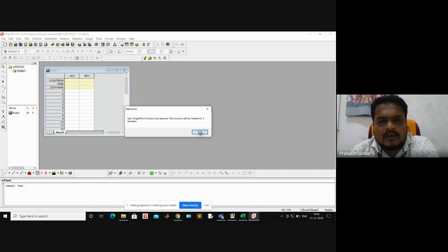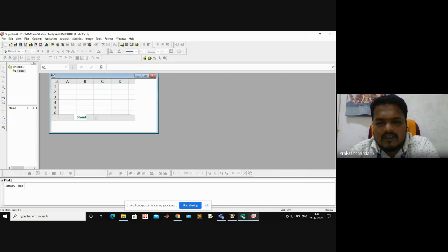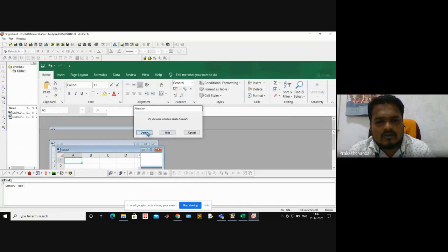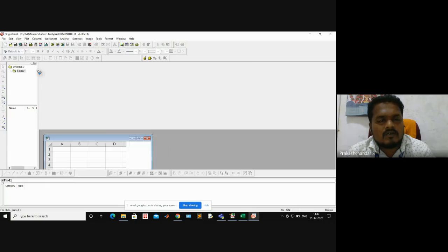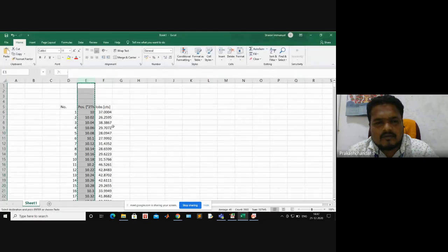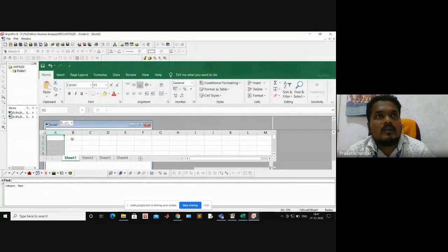Okay, now open a new Excel. Already we have that Excel file.